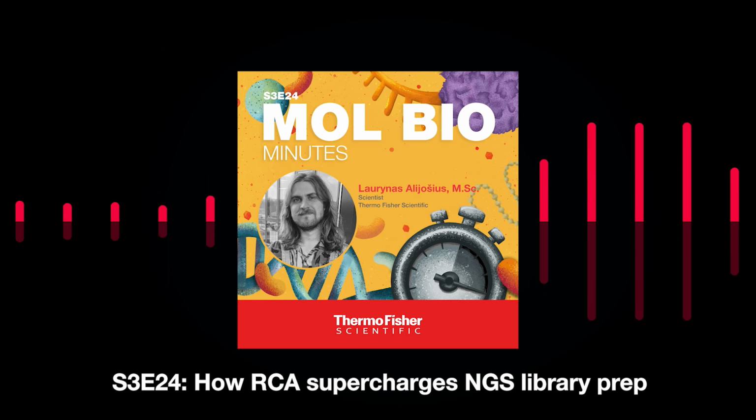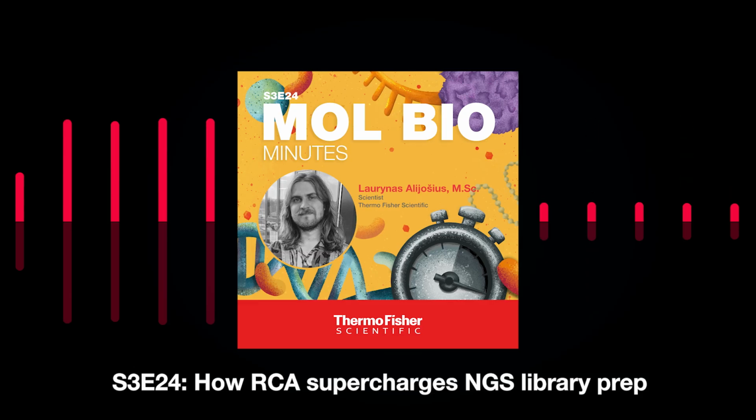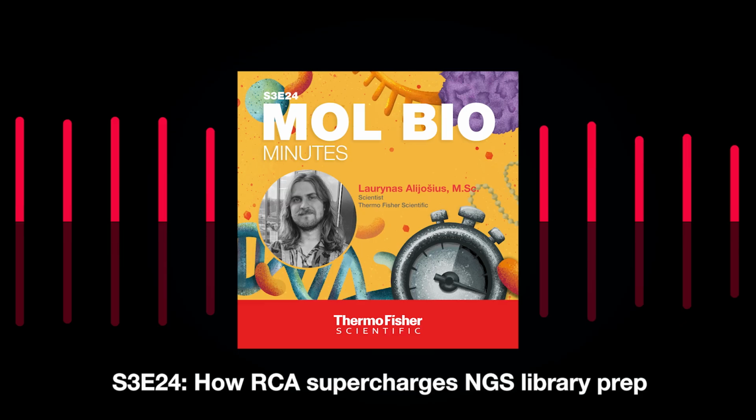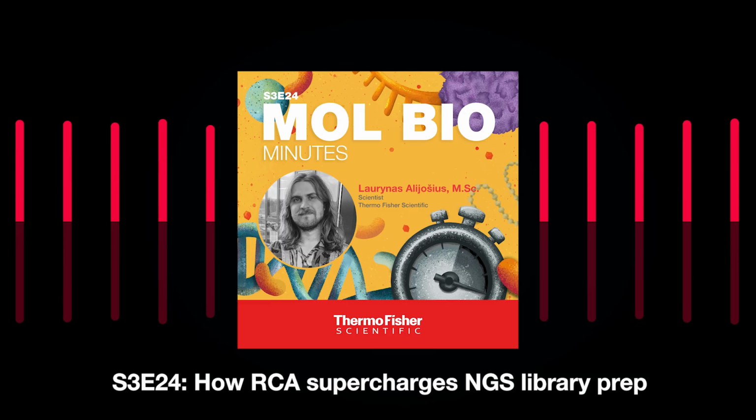Another cool thing about RCA is that you don't need to design and use primers specific to the template. This means you can amplify the DNA template without even knowing the sequence. I mean, how awesome is that? It makes things so much easier.